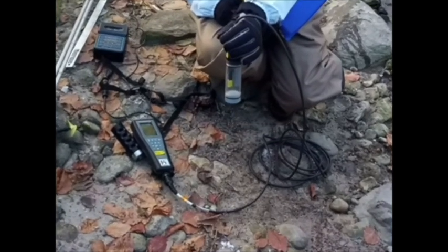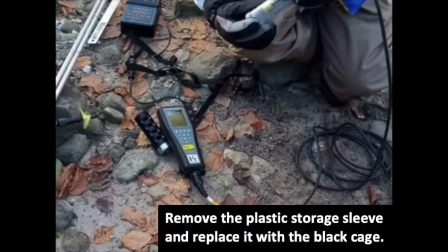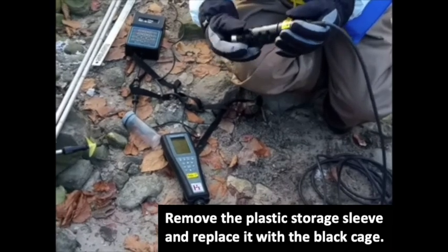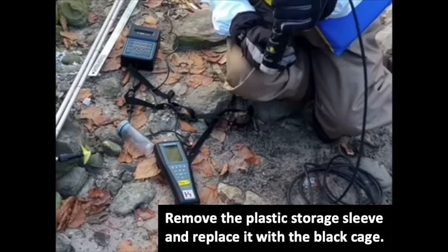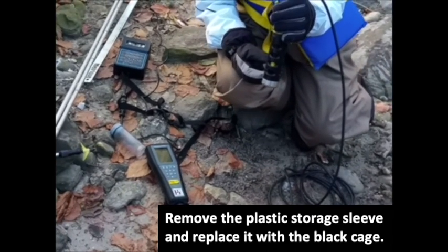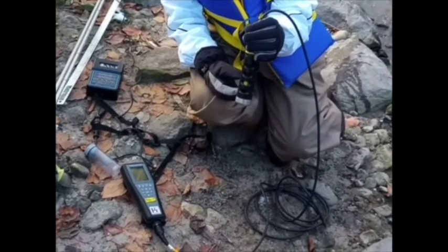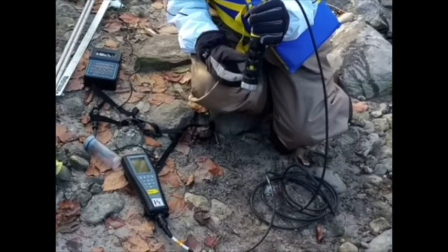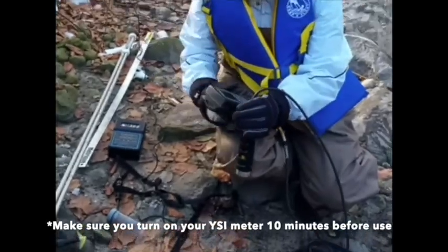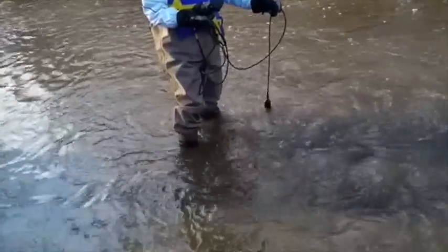The next step is using our YSI multimeter. Our lab assistant Alia will be removing the protective sleeve and placing the black hollow sleeve on the probes. This protects the very expensive probes from grinding against rocks or the substrate. The probes attached are dissolved oxygen, pH, and temperature. pH has already been calibrated in the lab; however, before using the dissolved oxygen probe, you always want to calibrate ahead of your sampling. Alia will then turn on the YSI meter and go into the middle of the stream to immerse the probe, making sure it is underneath the water.